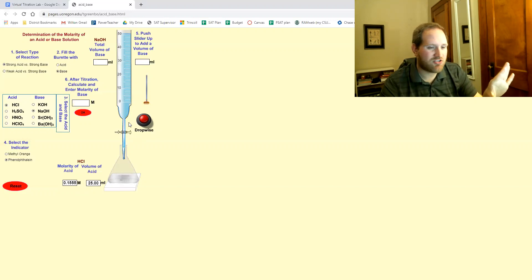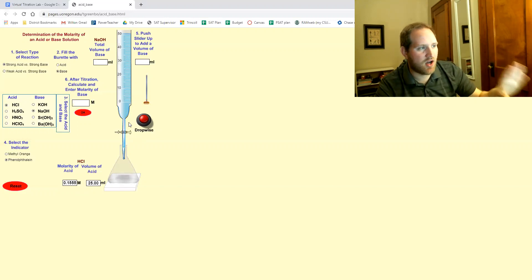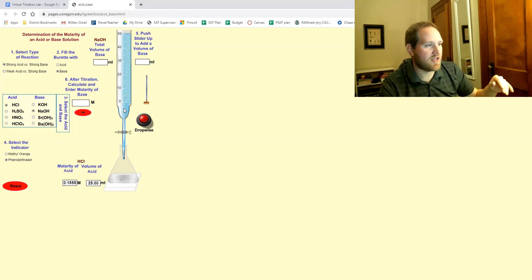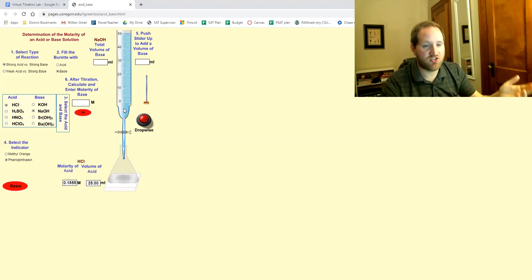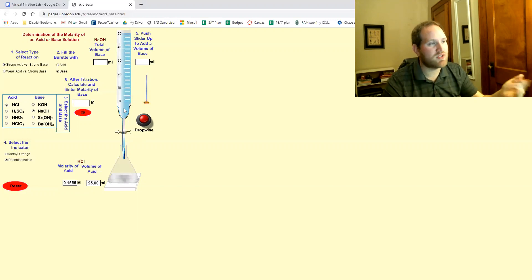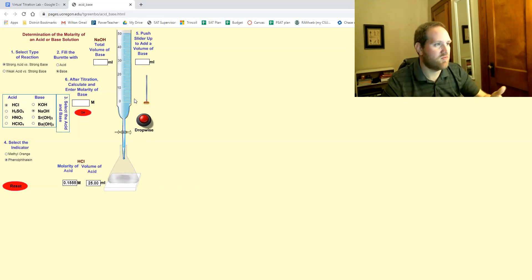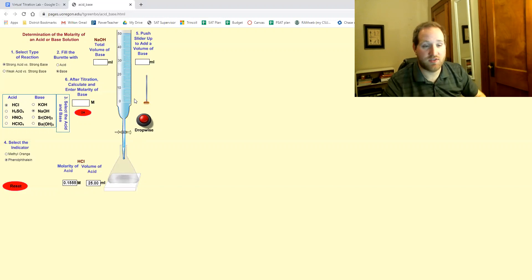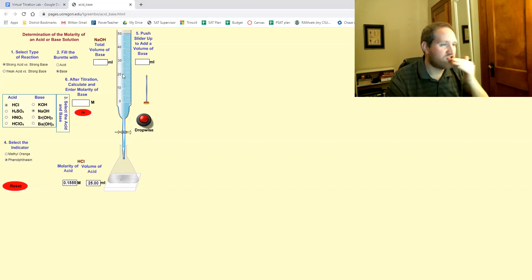The base therefore is our unknown. Now this is actually kind of the unconventional way of doing a titration and most of the titrations that we would be doing or if you go into higher levels of science you will be doing.